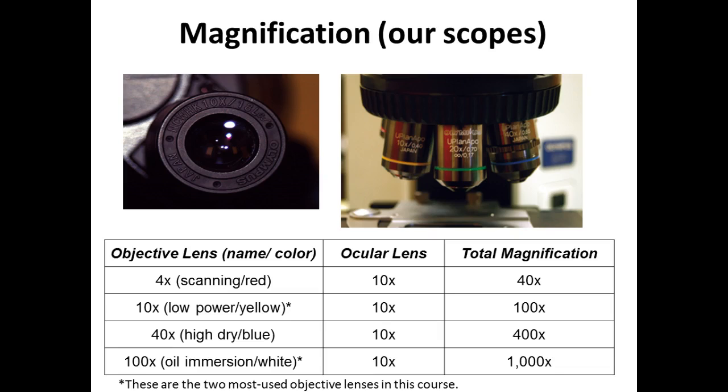Most of the ones in this lab are permanently blurry. You will be wasting your time trying to focus at this magnification because students don't follow directions. It's true. Okay, not the case for you guys, right? If you accidentally get oil on it, you're going to wipe it off right away.